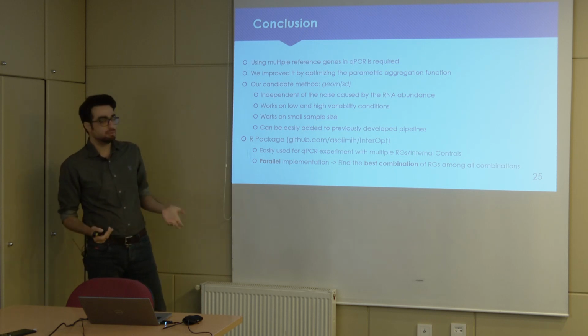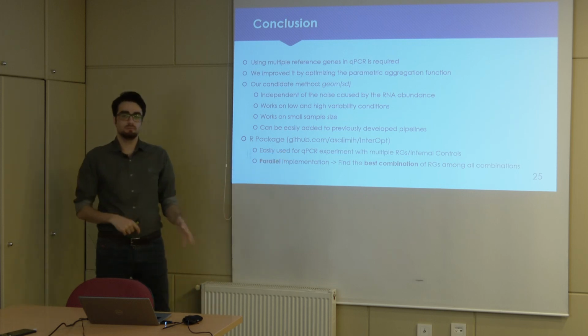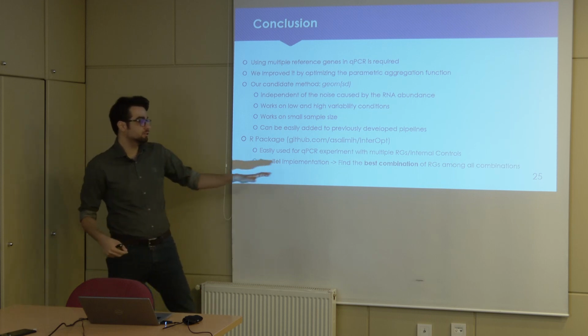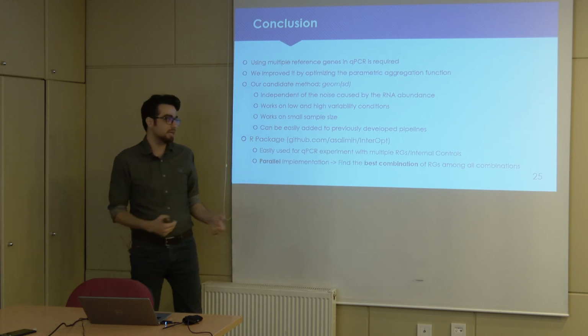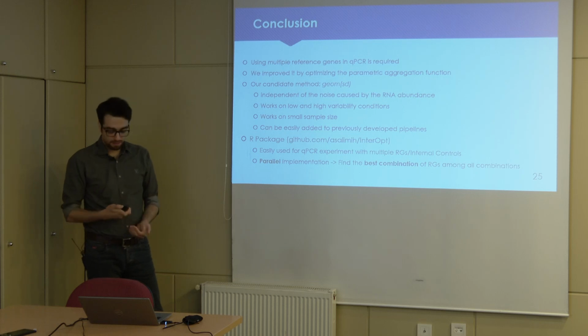We also provided some parallel implementations, both using CUDA and CPU. And you can also use it for finding the best combinations of reference genes among all combinations. Because it's parallelized, it can be run really fast.